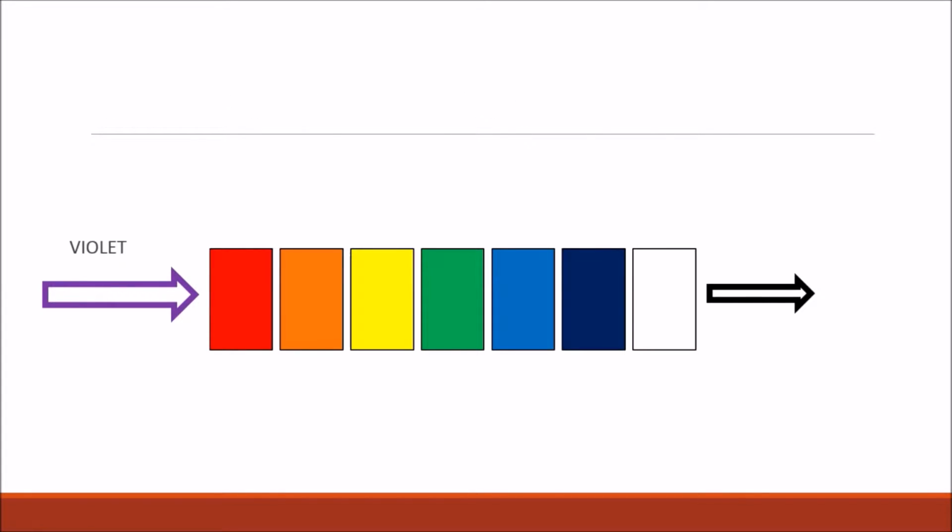However, when we decrease the energy from UV light down to violet light, as you can see, the solution which was giving off violet light is now back to colourless. This is because if any incident radiation is of equal or less energy than what the emitted light would be, there would be no fluorescence, because the rule is you have to have greater energy than what could possibly be emitted. So another example would be to use indigo.